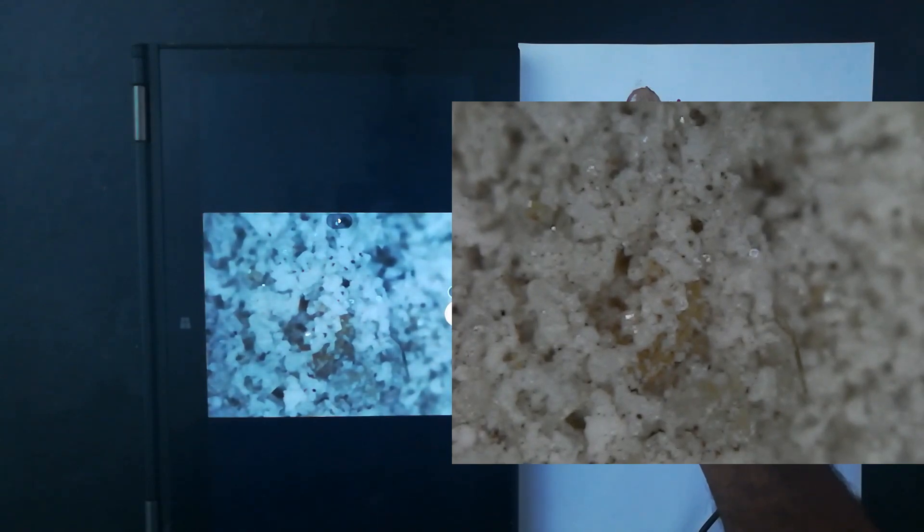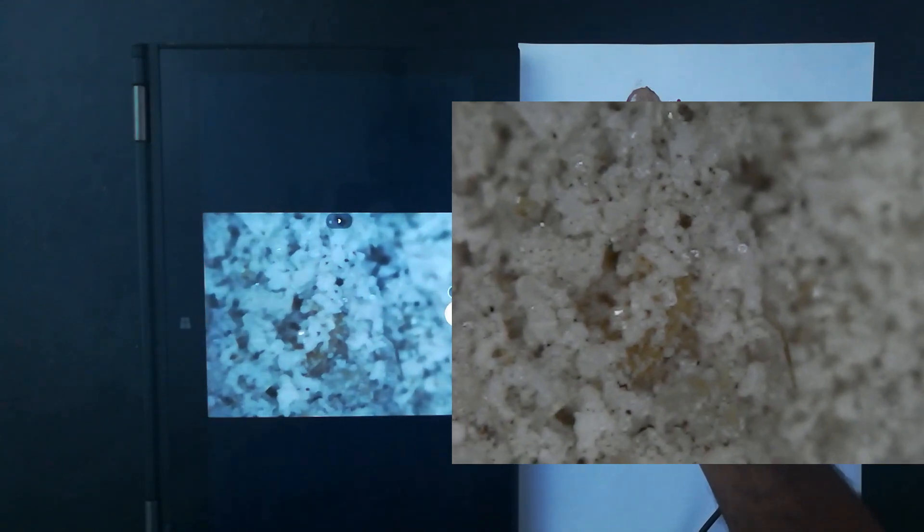Check this out. See, do you see this? There's this yellow chunk of something and around it this grayish color stuff. So, I think what we're looking at is definitely some additive, some binder sort of thing like maltodextrin or soy lecithin. I'm not sure. Again, same stuff. It's everywhere, this additive. I don't know what this thing is. But they've added like a bunch of this thing. Let me see if I can zoom in and find out a bit more about it.